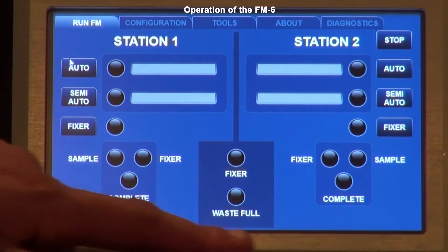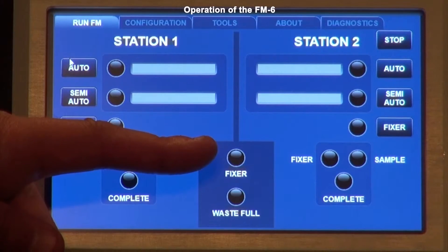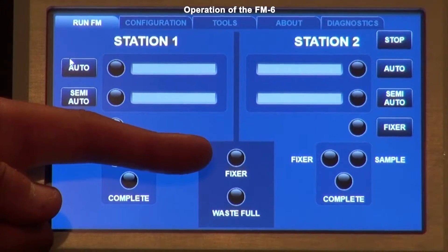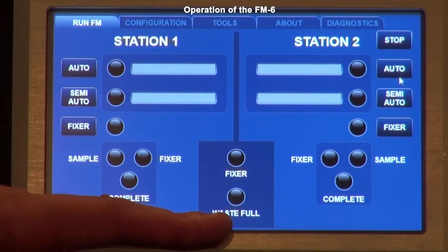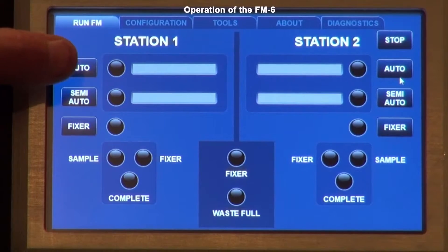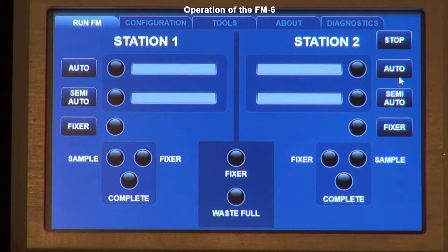In the middle, pertaining to both sides, you have a fixer light and a waste bottle full light. The lights turn amber and red depending on how much fluid is in the bottle. If the fixer is low, it turns yellow; if you run out of fixer, it turns red and you cannot use any buttons to run a sample. Similarly, when the waste bottle gets full it turns amber, meaning you need to remove and empty it. If it gets too full it turns red, preventing you from running a sample — a precaution to keep the bottle from overflowing into the waste vacuum pump.